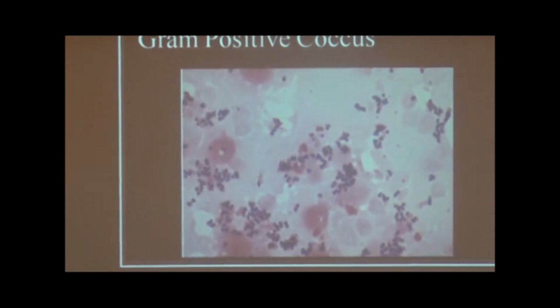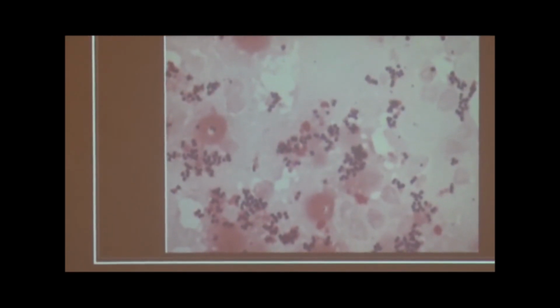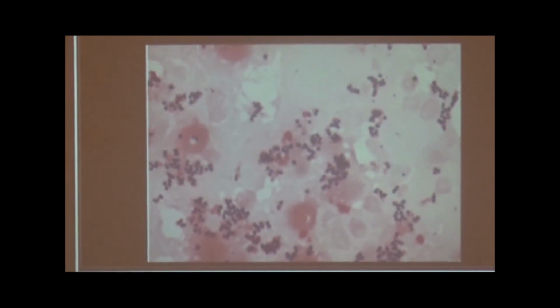This is a figure after gram staining. In the figure we can see blue colored round shaped bacteria in the smear. For this we use 100x magnification for the correct observation. Why do we get this blue color in the smear?